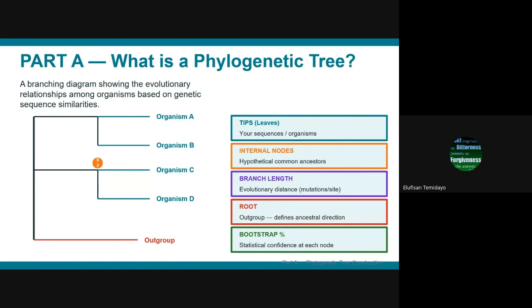Now, when you are going to draw your tree, you are going to get an organism. When you do your BLAST, you already know the family of organisms that you are working with, because it tells you by your BLAST search. Maybe you have just sequenced, you have worked in the lab, you have seen some phenotypes that you are looking for. Maybe you just even came across the organism accidentally, and it has a beautiful phenotype. Then you can send it for Sanger sequencing. And when you do that, you bring up your file, your chromatogram, then you extract your nucleotide sequence from it, then you do a BLAST search on it. And when you do that, it tells you what organism you have.